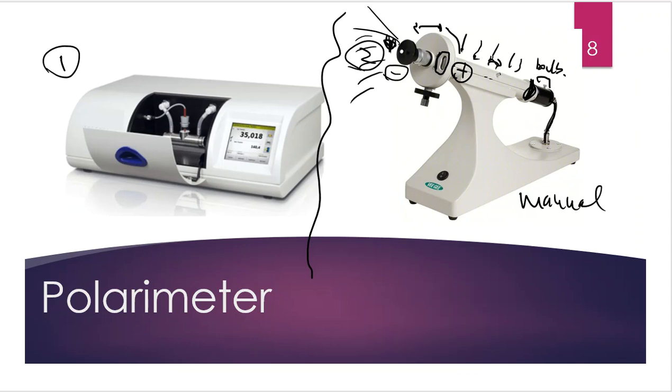Again, very basic, very simple. These things aren't drastically expensive, but we're really using your judgment call, because your values might be slightly different than someone else's because you see something different in the eyepiece of the instrument. And we want to do away with that, and we want something a little bit more automated if we can.